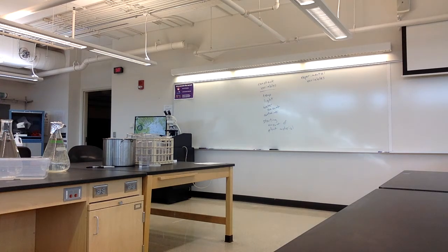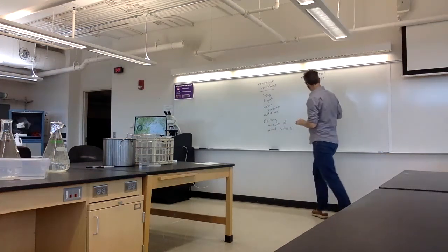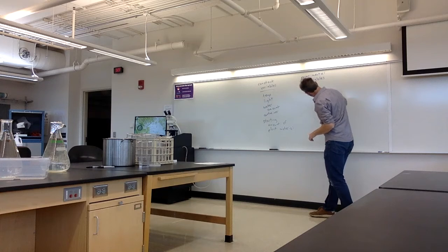Take a handful of these and space them out. And I think one of the things we're going to have to do is to figure out how to standardize how much we have. So in my mind, when I think about these, they're all the same size, but they have this kind of simplified, sort of like a triangular growth off to the side.